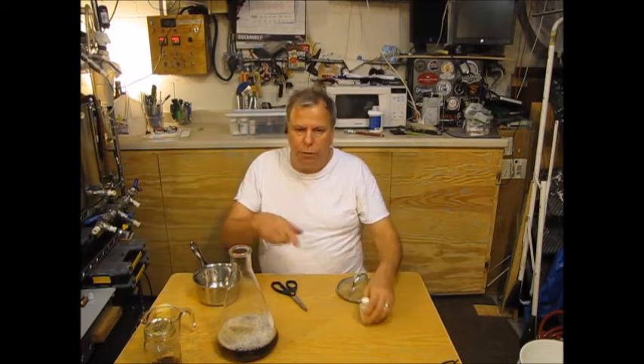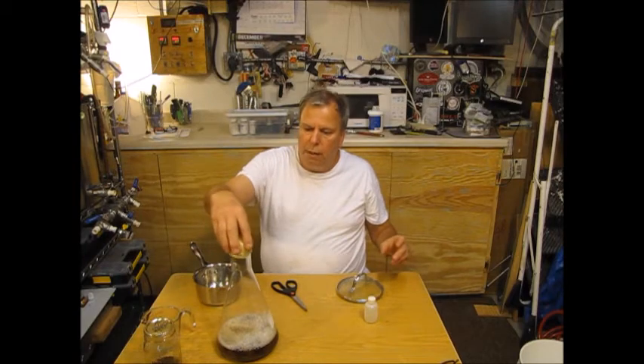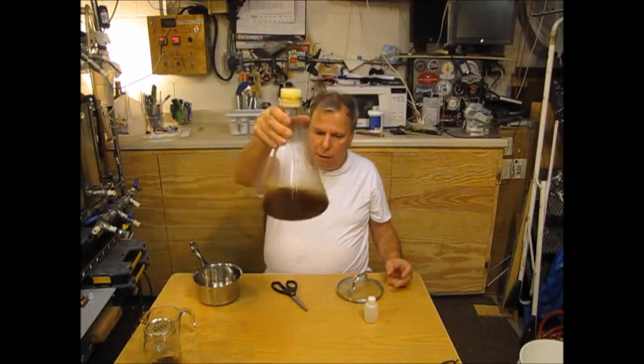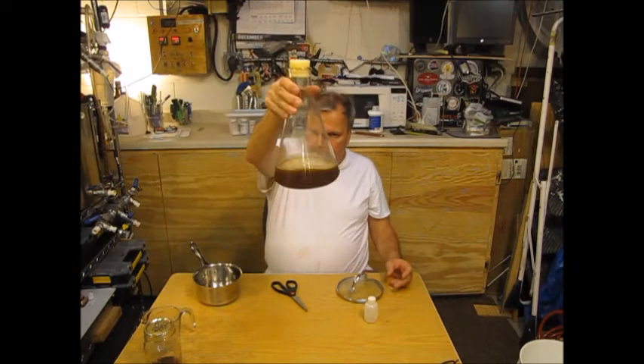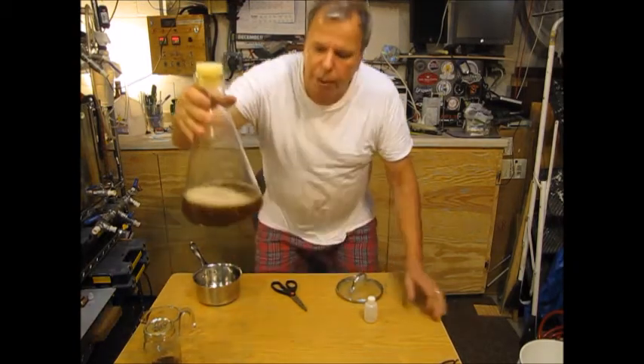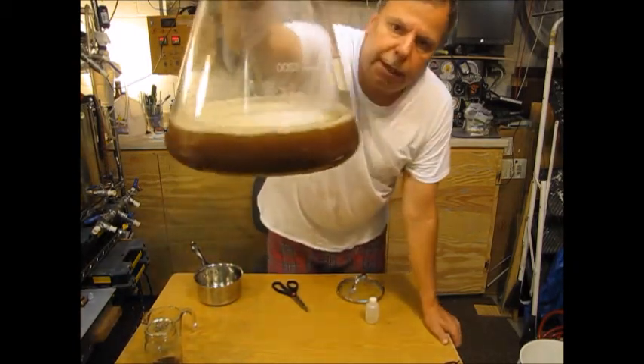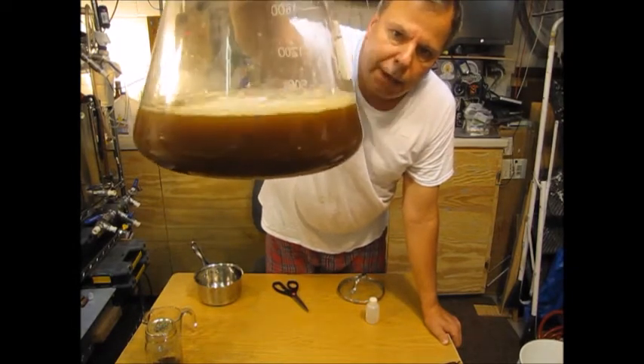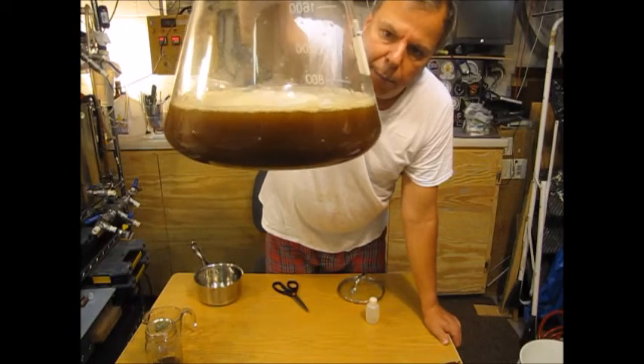We'll put this on the stir plate and let it go. We'll follow up tomorrow — it's about 10:30 at night right now, so I'll check on it in about 12 hours. Getting it stirred up and taking a close look — the color is kind of a light brown and not milky at all.